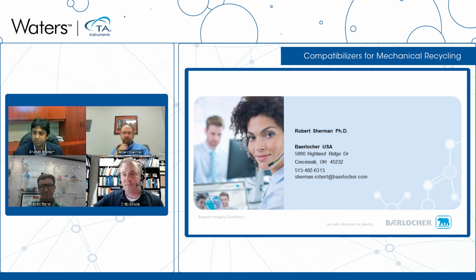Right. That's helpful context, especially as you touched on some of the challenges with SEC for these materials. The next question touches on a slide that Dr. Sherman showed towards the end, around the data with the multiple passes of the recycled resin. The question is, shouldn't melt index get higher with multiple passes as the viscosity and molecular weight decrease? And I think you touched on this briefly as you spoke about the rheology data that followed.